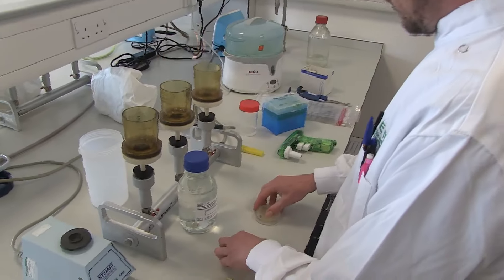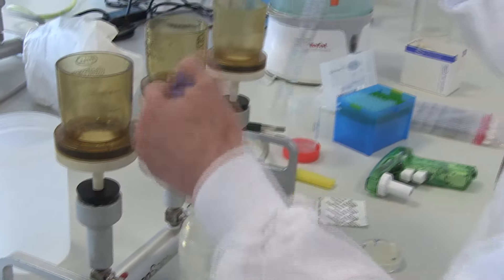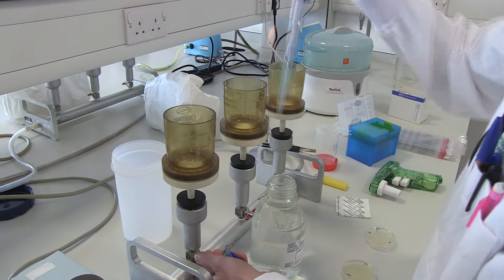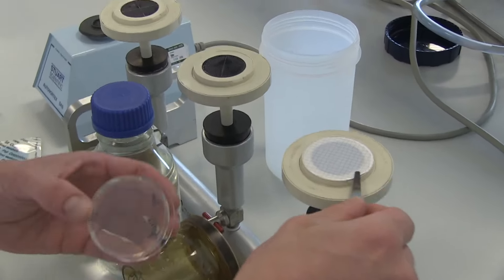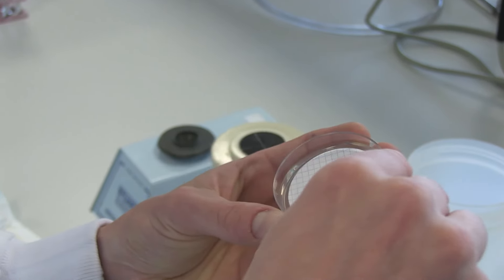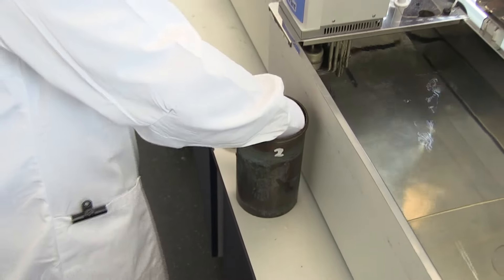When the samples arrive in the lab they're processed straight away by membrane filtration. We sample a known volume of water through a filter with a known membrane size, which traps the bacteria and allows the water to pass through. We then take the membrane and transfer it to a nutrient agar plate — these are specially formulated plates containing an enrichment growth media that encourages appropriate bacterial growth.